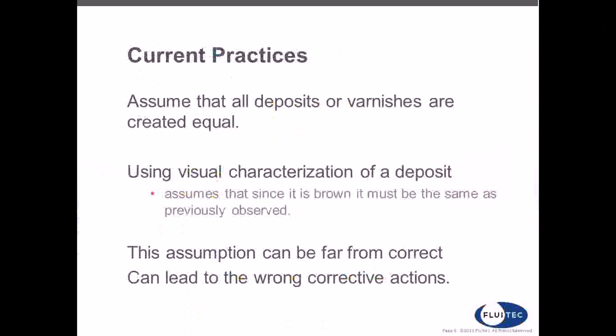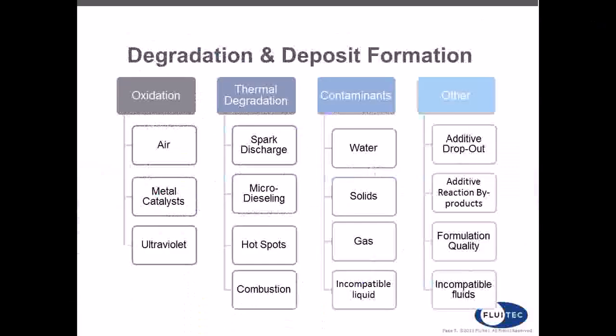So one other point that I want to make here, if there's any takeaway that you get from this presentation, if there's one thing that you remember, I'd like to encourage you to remember that lube systems are typically out of sight and out of mind until there's a problem. And it's really hard to actually see what's going on inside these systems. They're closed, and there could be all sorts of different stresses on the fluid that are really not so visible while the system's operating.